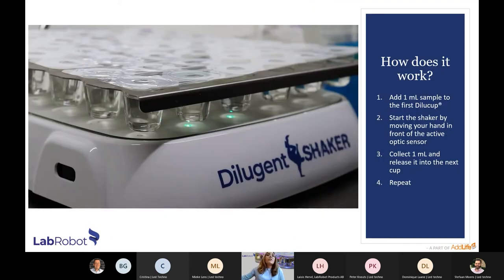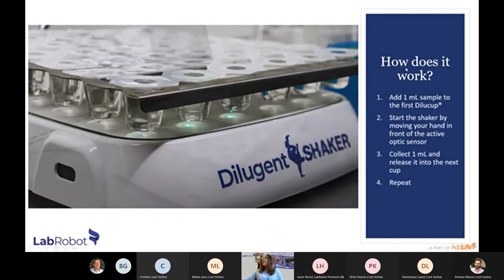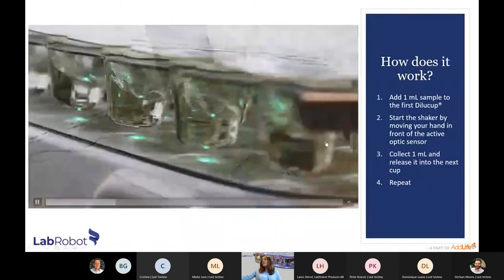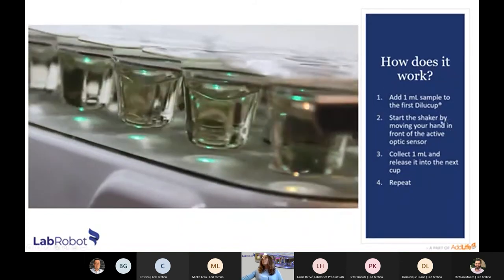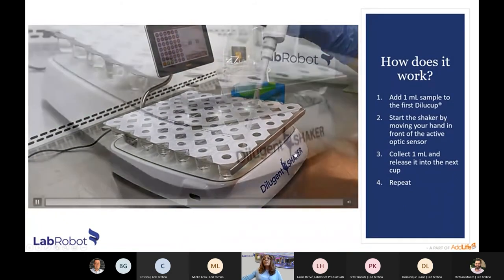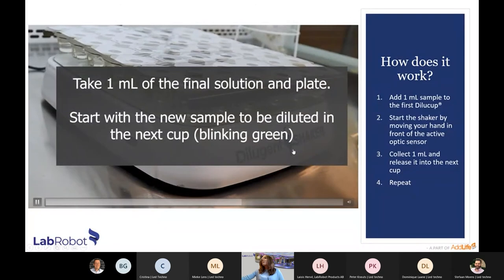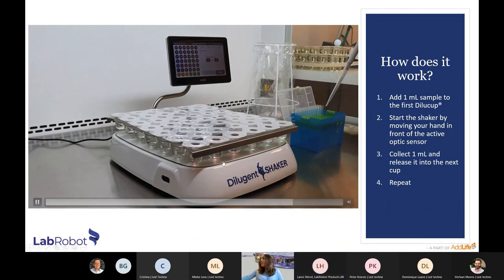Here is a video showing how the system works. First, you place the blister of Dilucups on the shaker and tear the protective film. Then you add one milliliter to the first Dilucup and shake it by moving your hand in front of the active sensor. You collect one milliliter and release it into the next cup — and repeat this process until you reach the final concentration you want. You can see the color changing: green, orange, and red, guiding the user throughout.